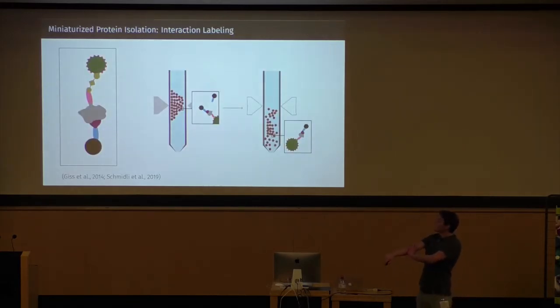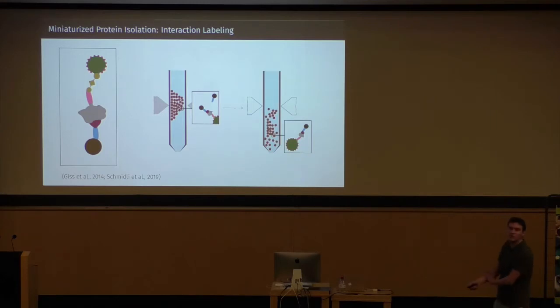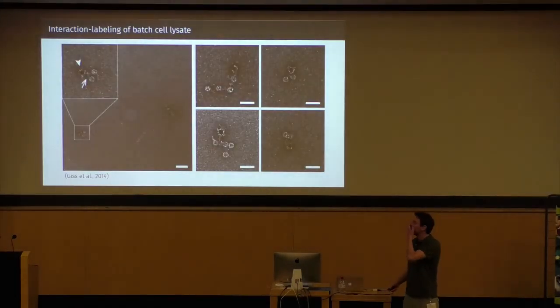Another technique we are using for getting more information about proteins and their interactions within cells is interaction labeling, where we use a Fab fragment with a superparamagnetic nanobead for one protein and an electron-dense label against the potential binding partner. Combining this with the electromagnetic trap and the grid preparation methods we developed before allows us to label interaction partners, wash away unbound labels and unbound proteins, and then write those labeled interaction partners onto grids and analyze them in the EM. And this can then look like this.